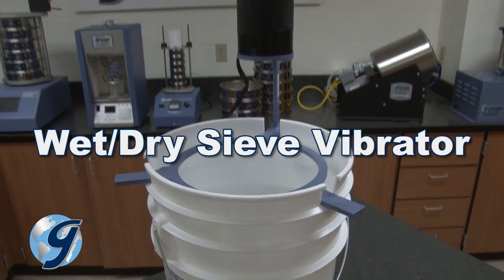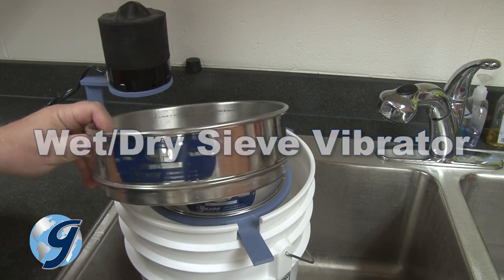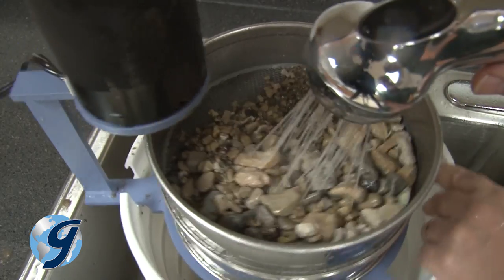For rough separations or sample preparation, a wet dry sieve vibrator can hold one or two sieves over a bucket while being washed.